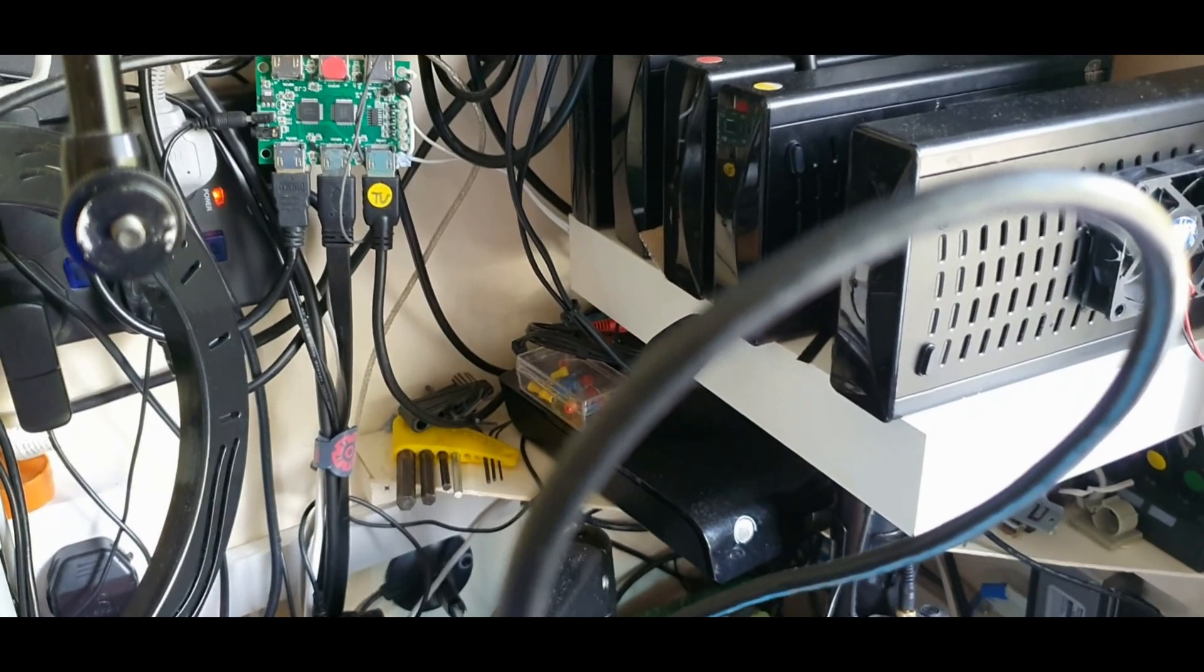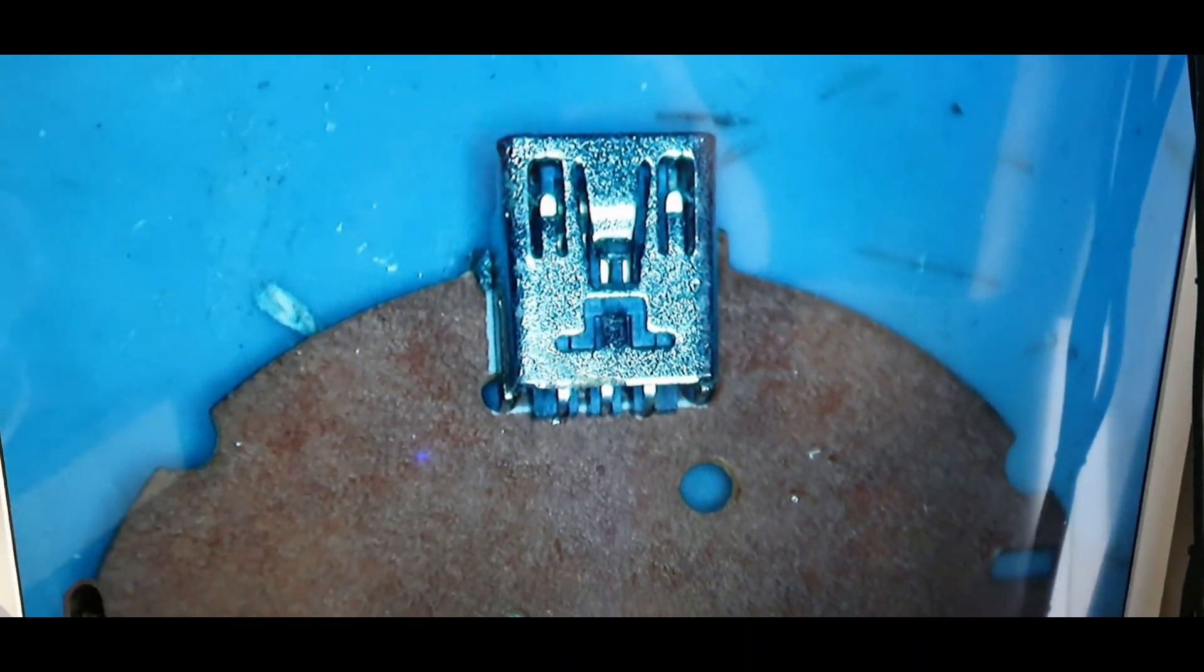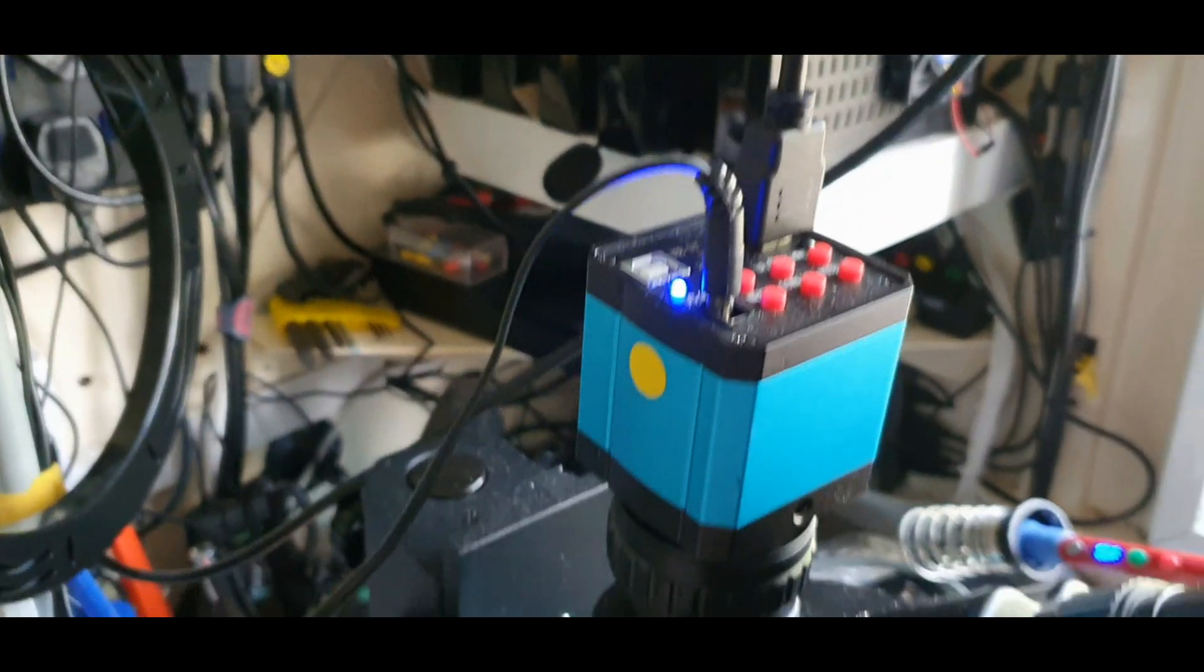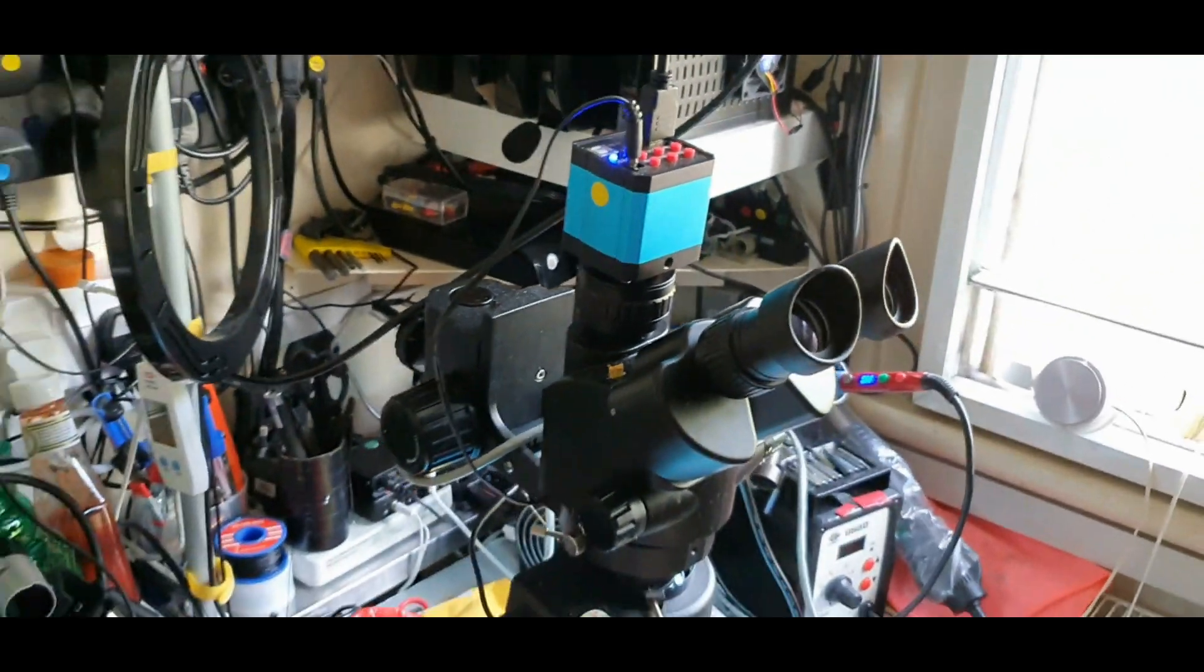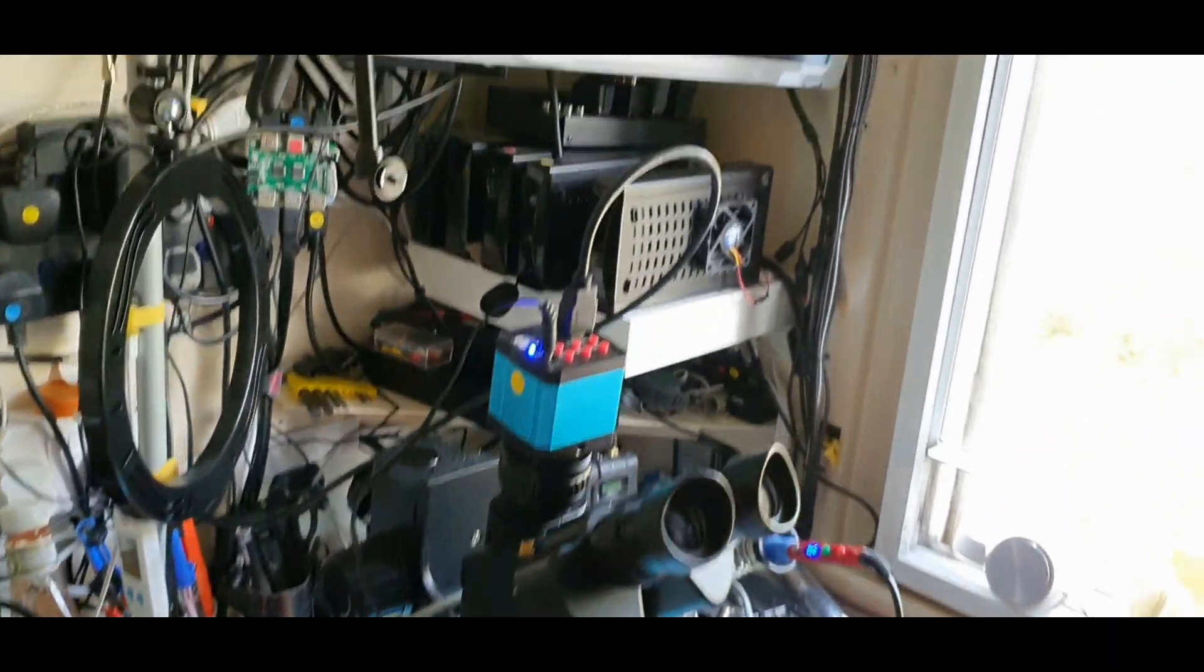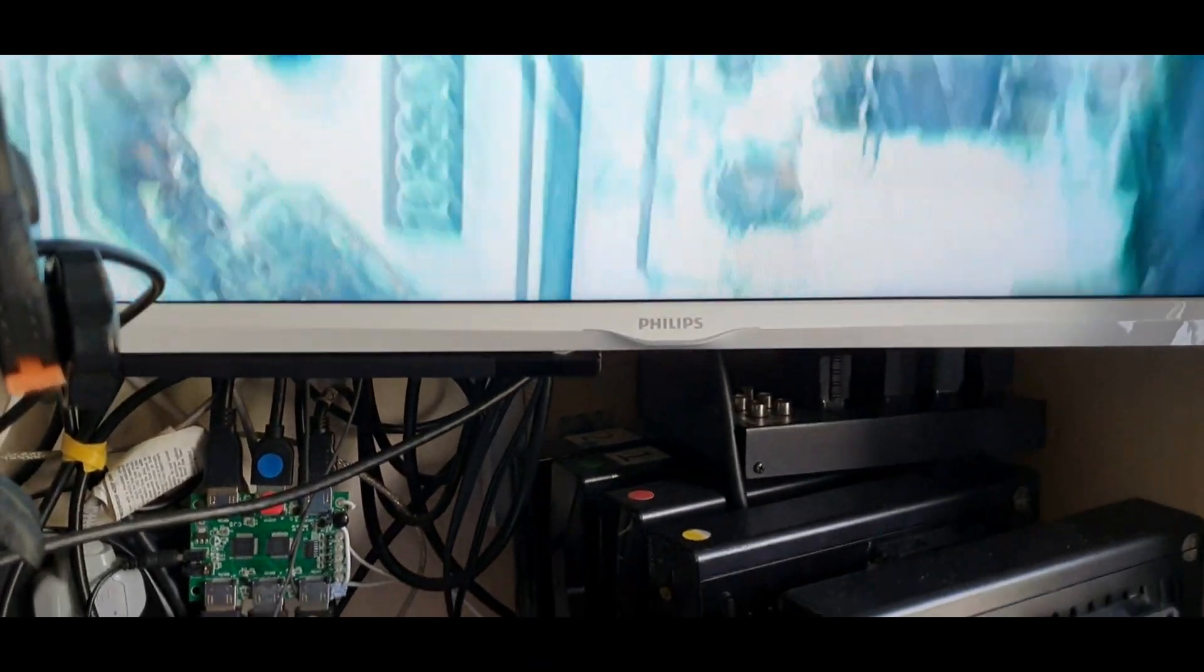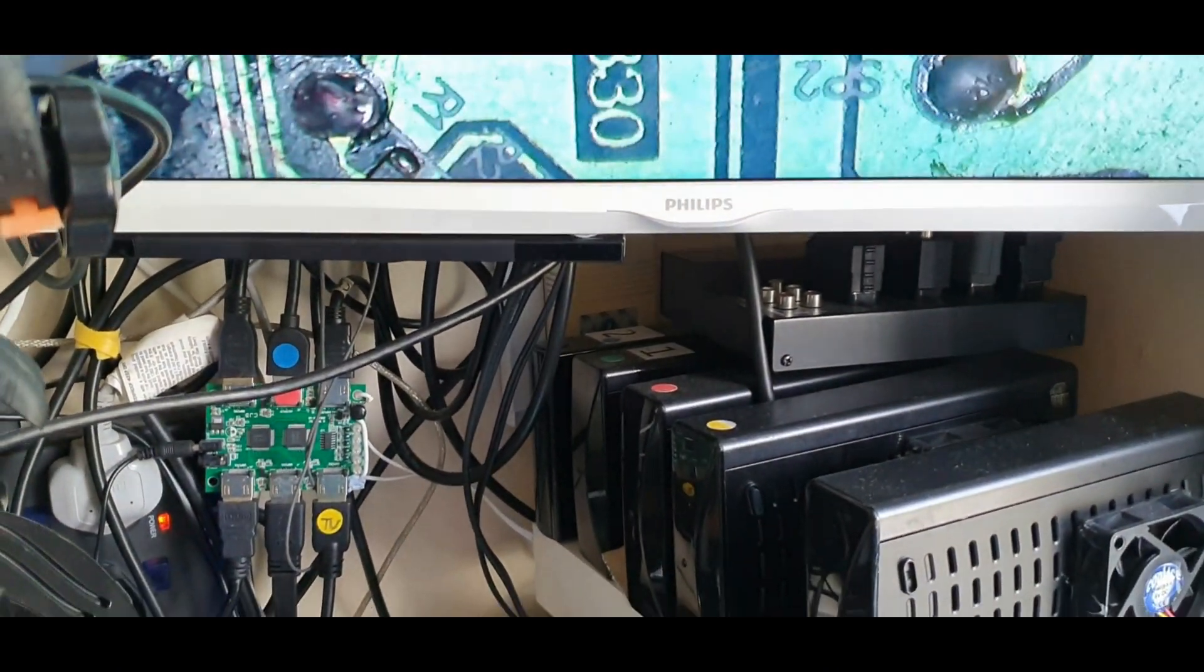Yeah, you can see much more. Much more than that one. Turn it this way. There's so much more you can see. It's not bad.